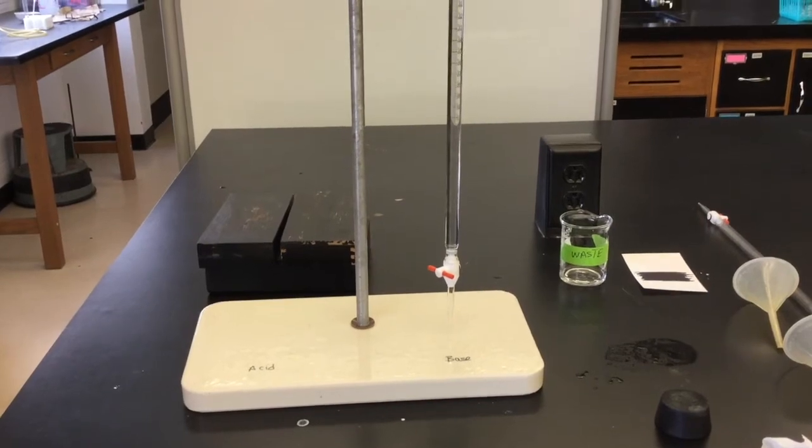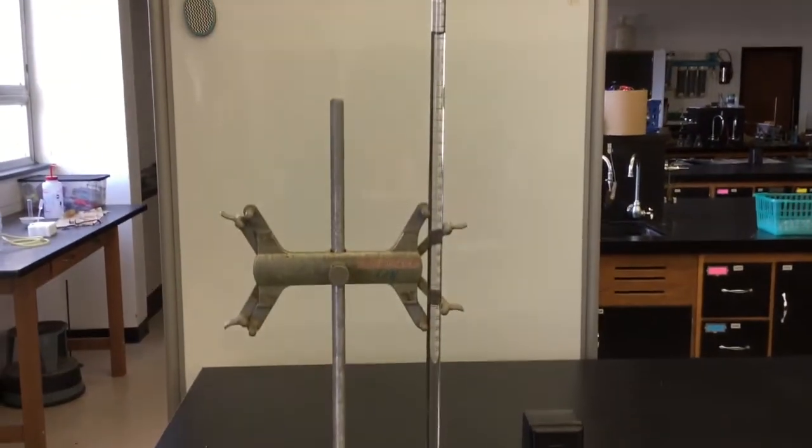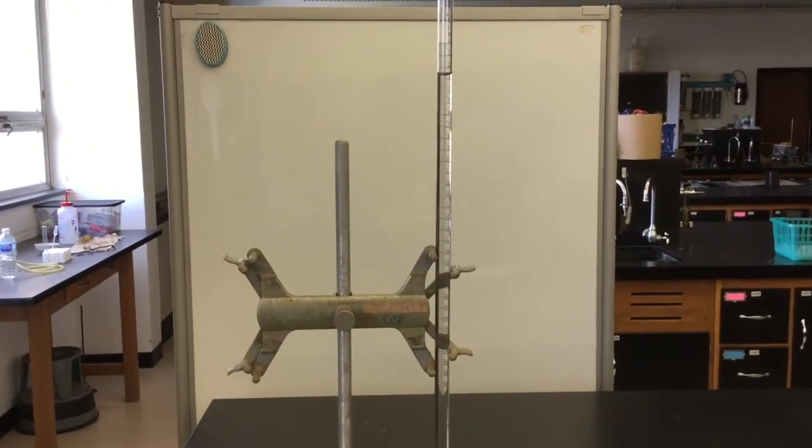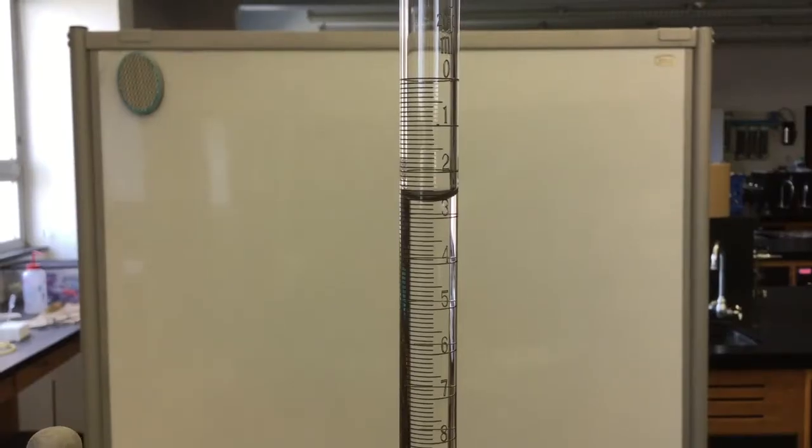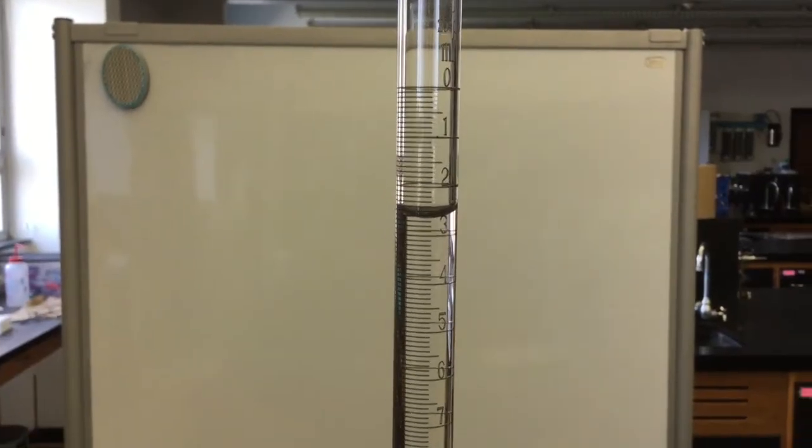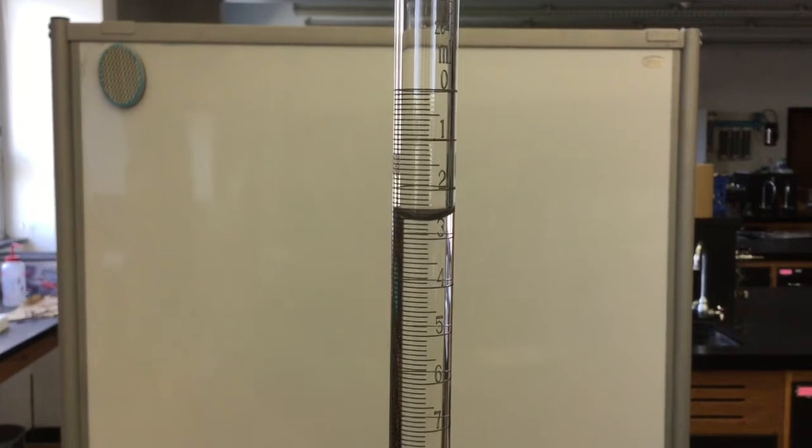Burettes can be difficult to read, so you may need to adjust the height so that the level of the solution inside is at eye level for you. Depending on whether the markings on the burette are black, white, or some other color, you may want to have a background that contrasts so that you can easily read.